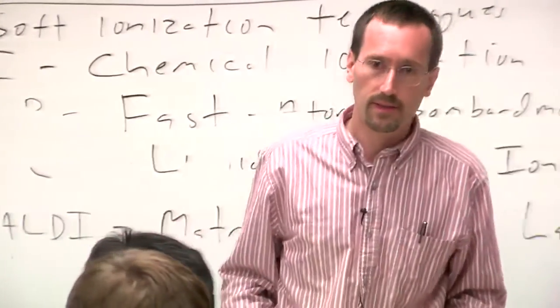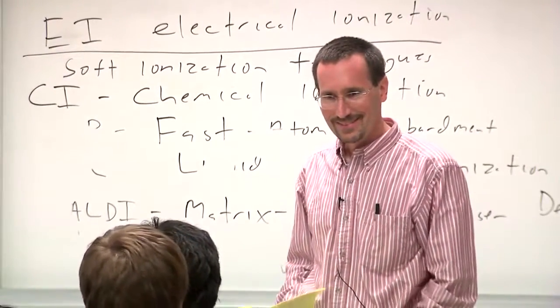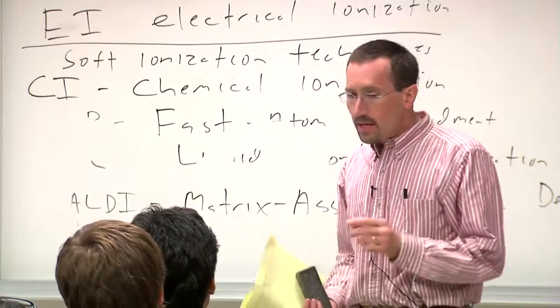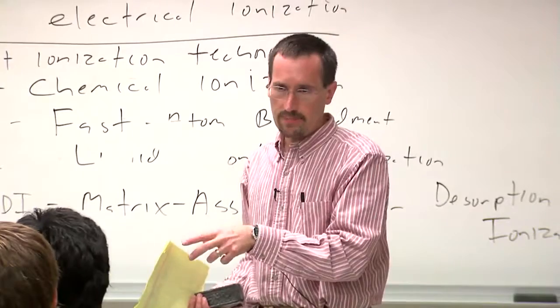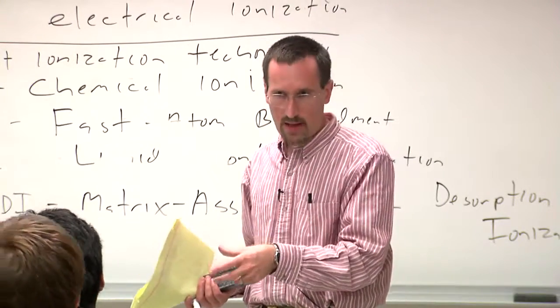This is kind of like a useless question, but do you get polymerization in a mass spec of radicals? Do you get polymerization of radicals in a mass spec? Because mass spectrometry is conducted under conditions where your molecules are not typically colliding, you will not see polymer.